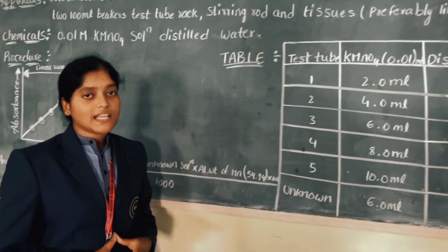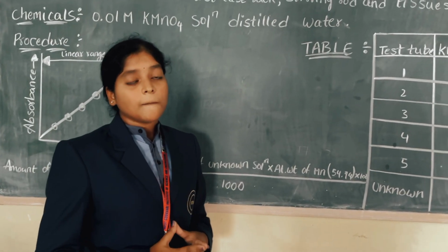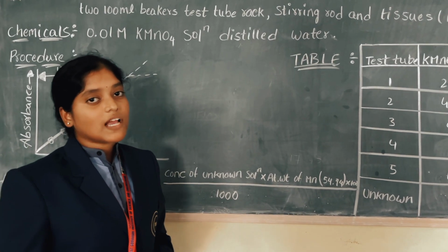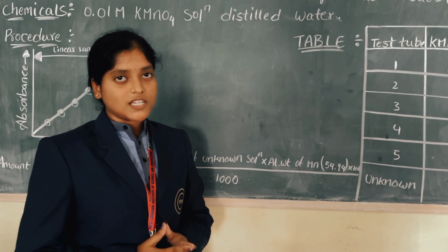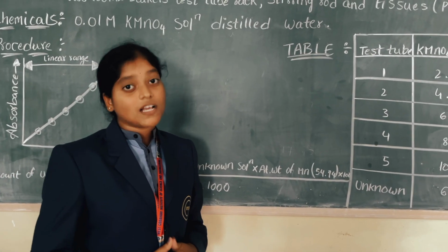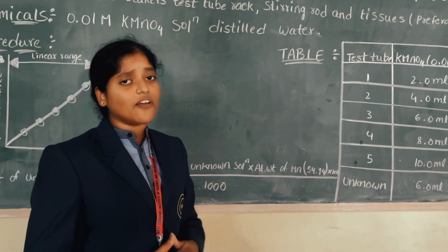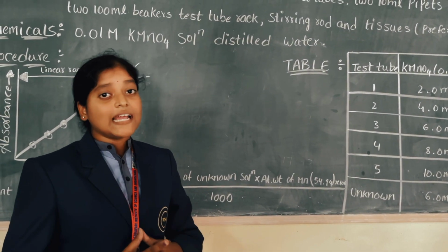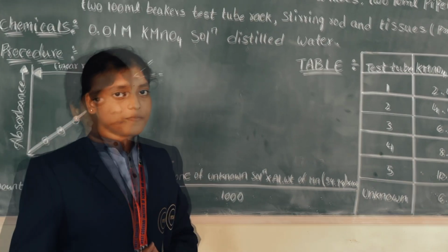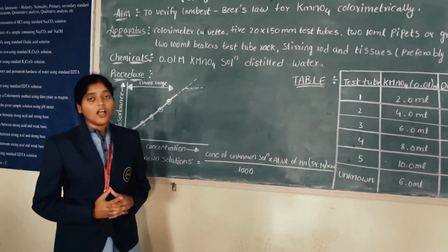By this we can get the concentration of unknown solutions, and we prepare the 5 test tubes in a clean way so that we can observe the unknown concentration of the solutions. We wipe the outside of the cuvette with neat and clean tissues and hold each cuvette by the ribbed side. Then fill the cuvette with the pipette, measure the absorbance, and calculate the concentration by using the formula.